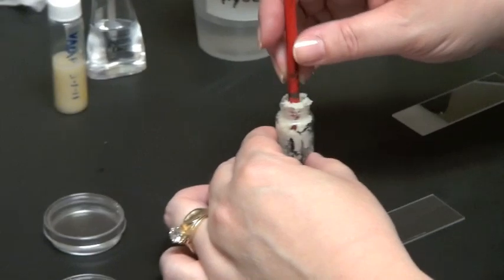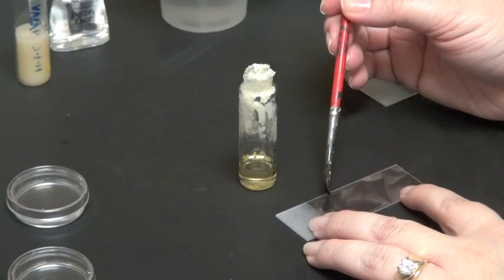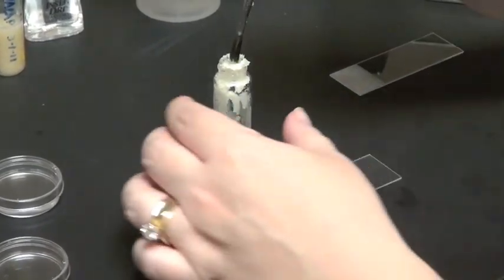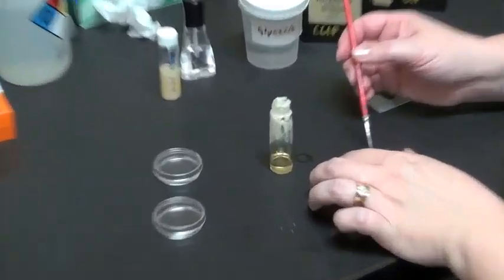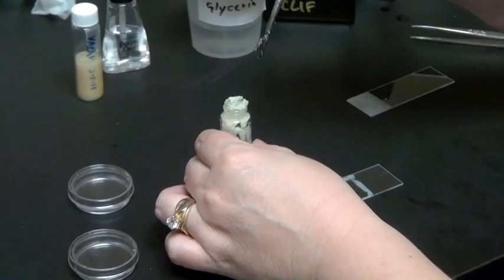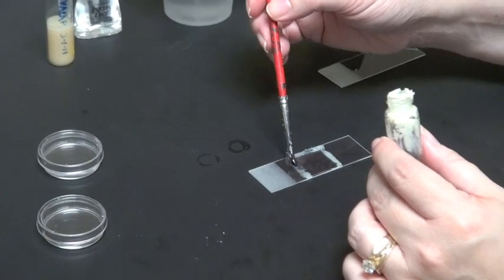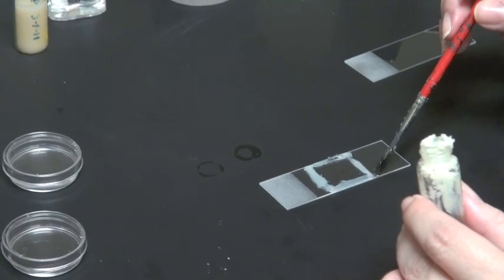So for this, I'm going to use a paintbrush. My paintbrush here is a little big. You probably want to use something a little smaller. And you can either dot on the edges to secure it, or you can, if you would prefer, paint all the way around. This wax is going to seal the glass cover slip directly to the slide. Who says scientists can't be artists?